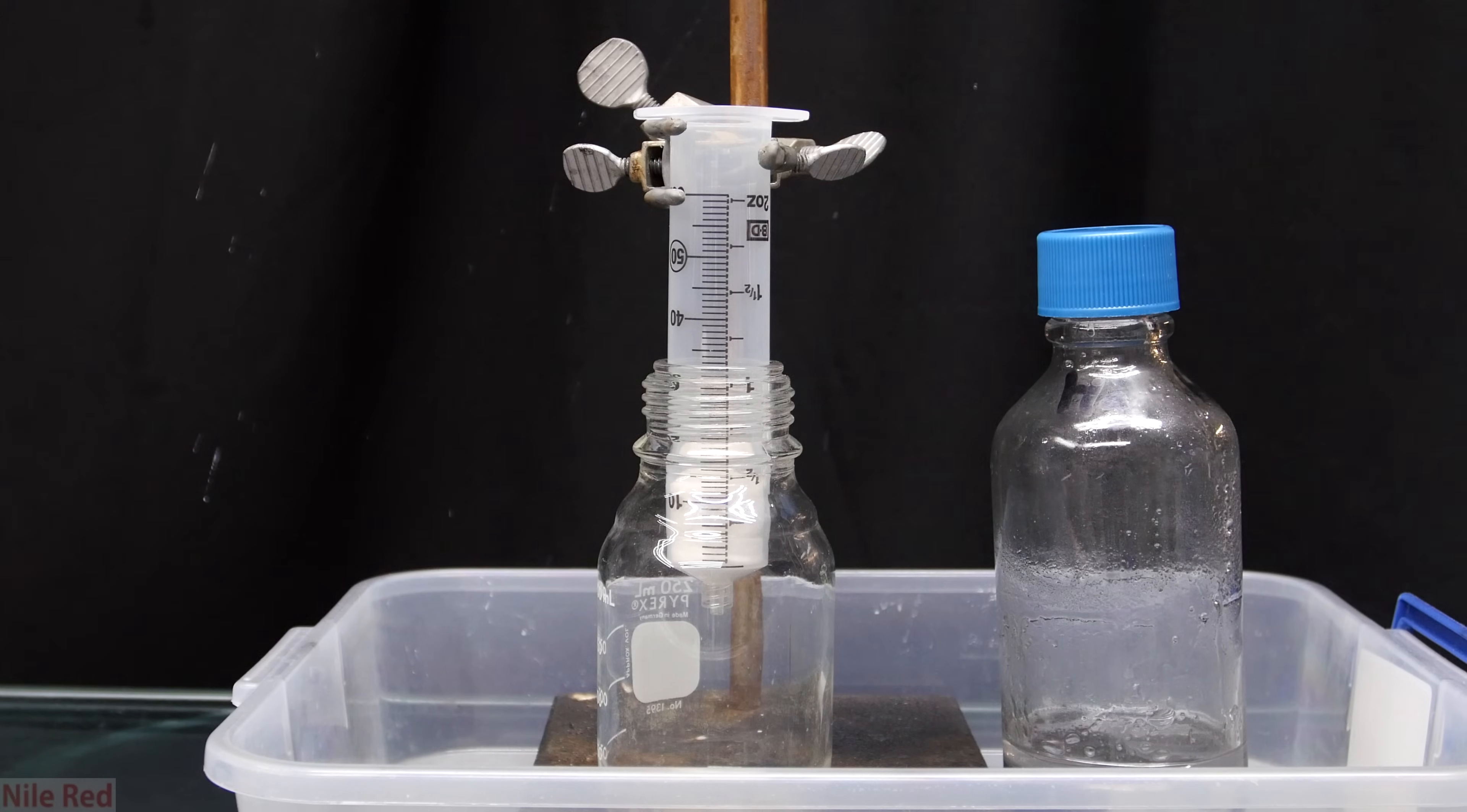I then prepare my filtering setup like you see here. Everything is placed inside a bucket just in case there's any spills or splashes. I highly suggest you do this when you work with mercury because a spill is a huge pain to clean up. Also the syringe is placed inside the bottle so no mercury can splash out.